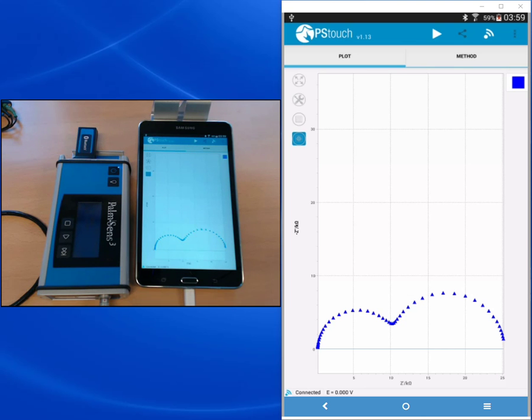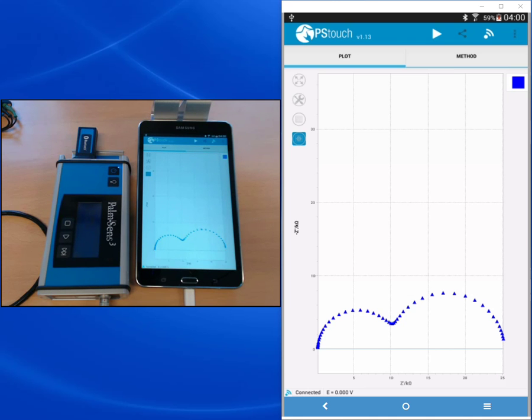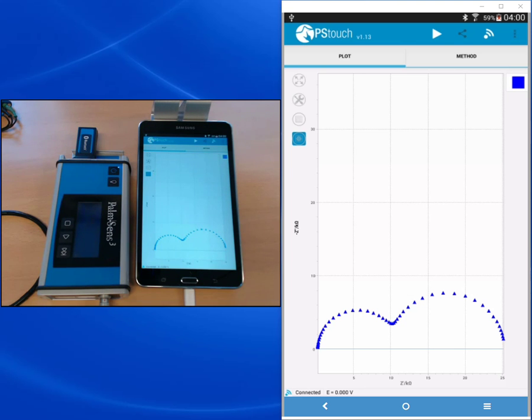So as mentioned before, to extract the important parameters from these graphs you would need to export this data to another software. A very popular one is the software ZView. PS Trace has a one-click to ZView export where you can with one click just export your data to ZView and do your fits to equivalent circuits and equivalent circuit design.